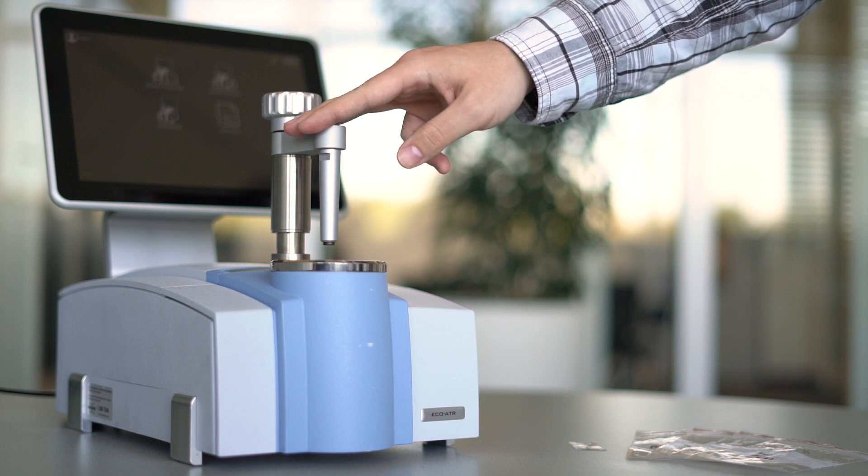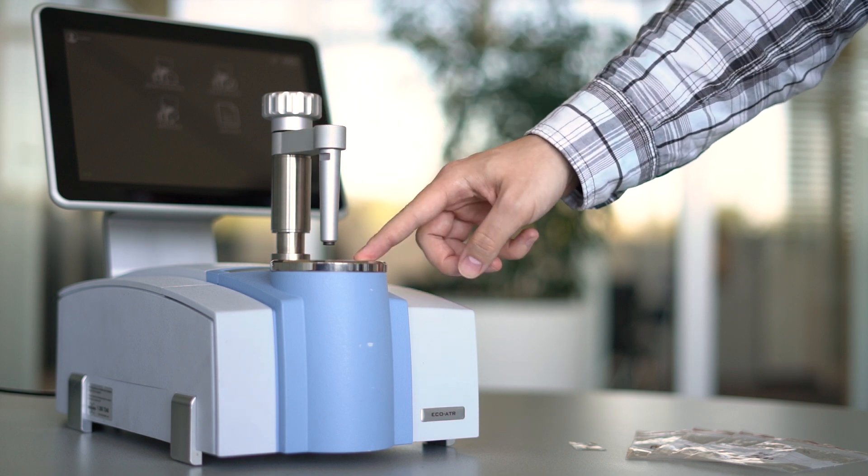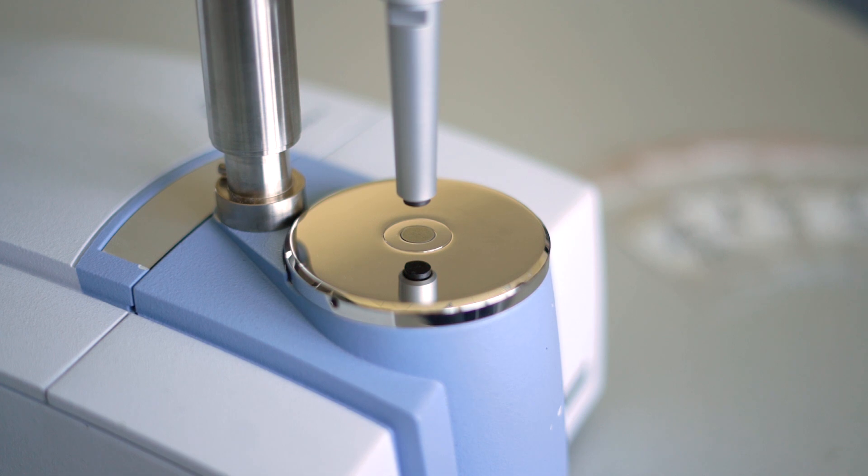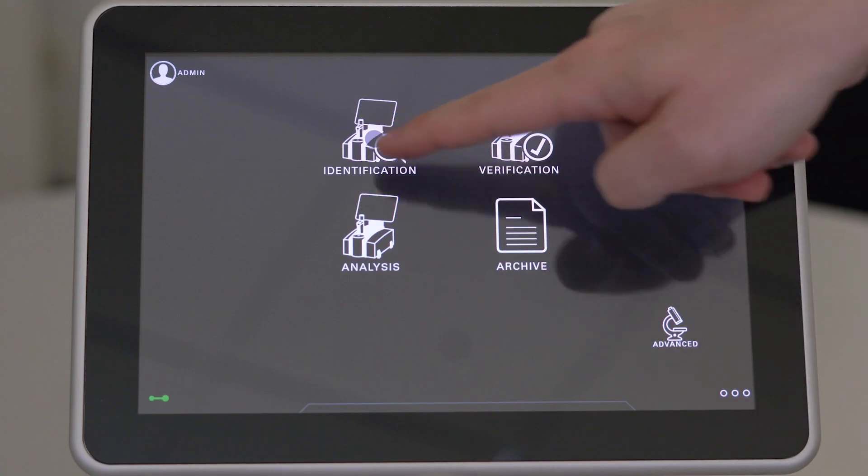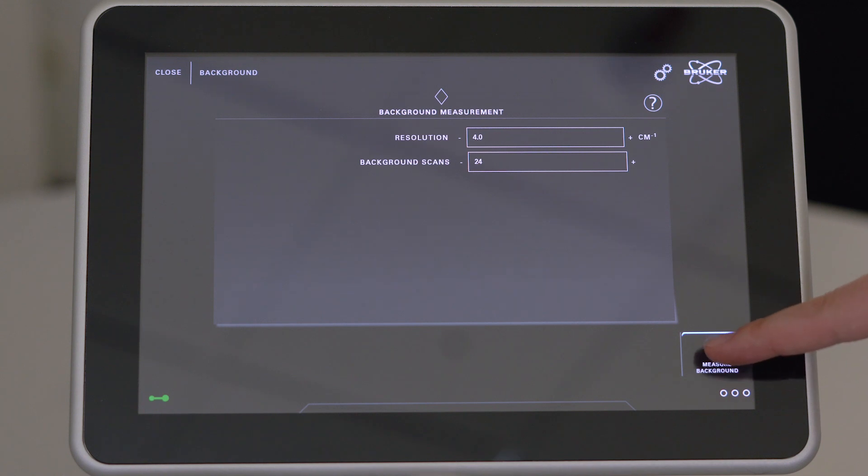We are going to use the attenuated total reflection measurement technique, in short ATR. More precisely, we are utilizing a germanium ATR crystal. With this setup, we can specifically analyze the first micron of a sample surface, making it perfect to investigate thin layers.